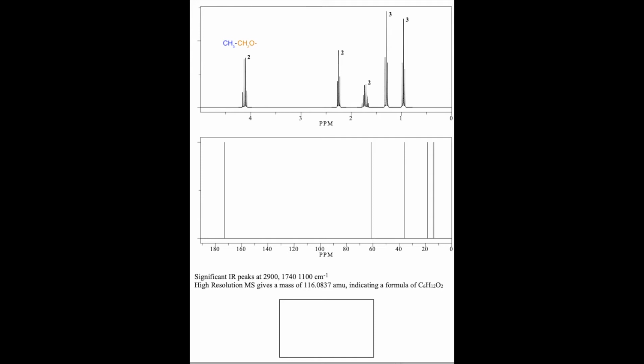And methyl groups are kind of the same thing, right? If you have a CH3, it can only go on to 1 more thing. If you start with something that integrates for 2 protons or 1 proton, those are going to go off in multiple directions, and it just makes things complicated. So in this case, I have 2 peaks that integrate for 3, so likely 2 methyl groups.